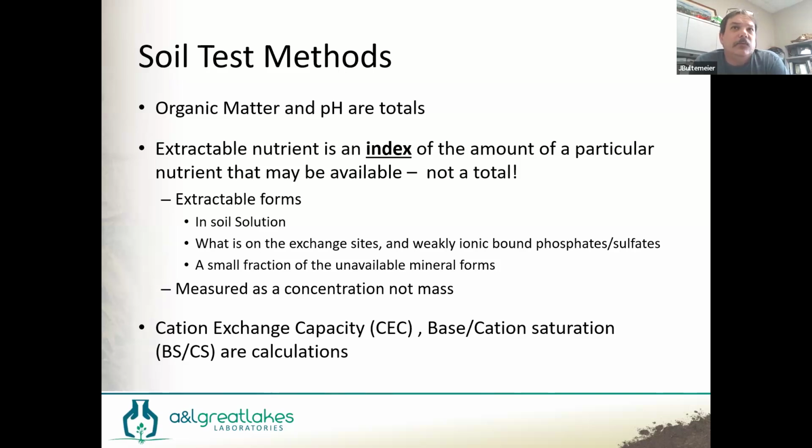That's how we do a soil. When we go to a compost, we actually do a complete digestion. We take that compost, put it in acid again, and put it in an industrial microwave under pressure, and we digest that compost all the way down to its core elements. It will be liquid, with just a couple flakes of material when we're done. And we measure that acid. In that case, it is a total amount of, say, phosphorus or potassium in the compost.